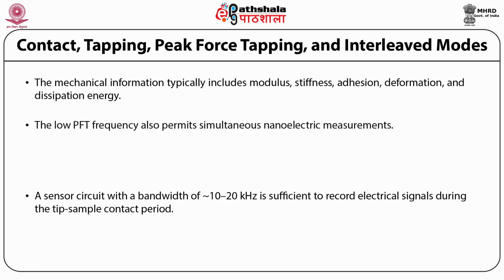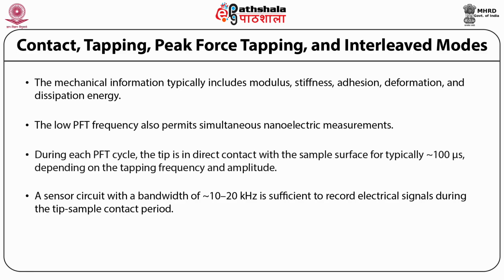The low PFT frequency also permits simultaneous nanoelectric measurement. During each PFT cycle, the tip is in direct contact with the sample surface for typically nearly 100 microseconds, depending on the tapping frequency and amplitude.